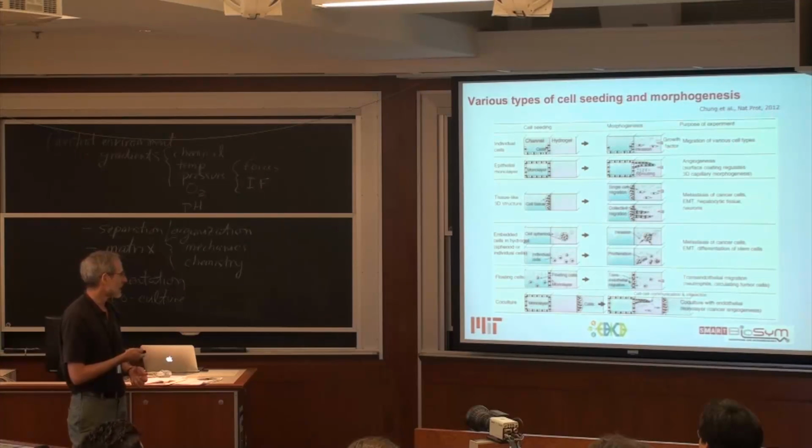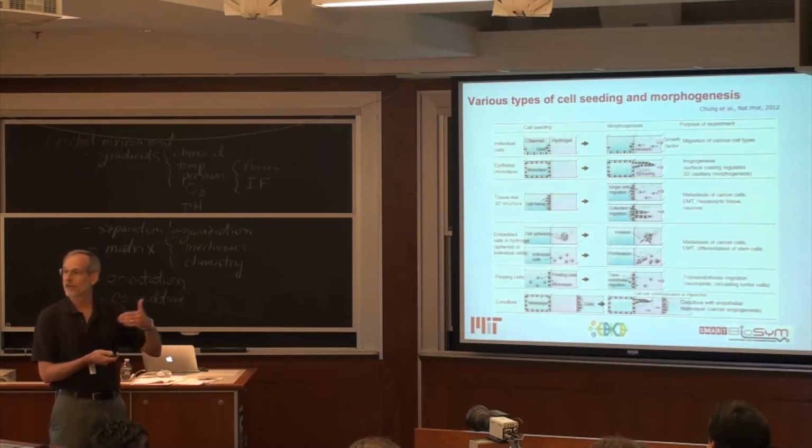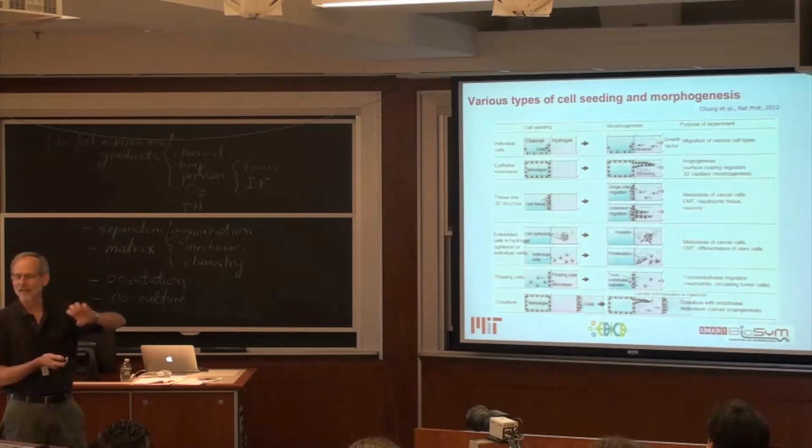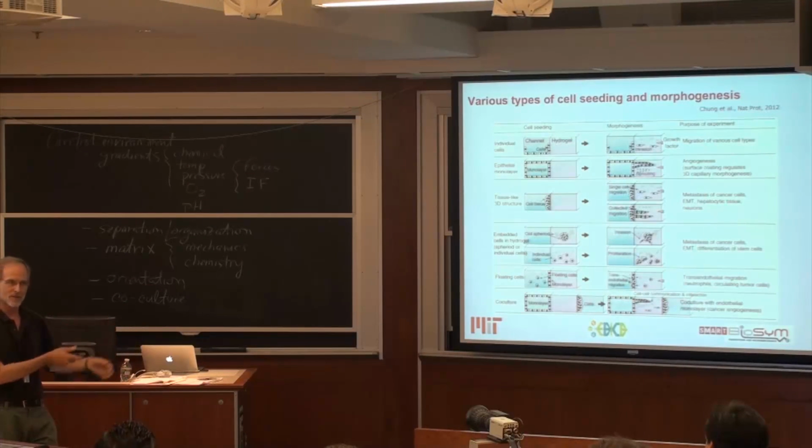the tissues. And you can do this then, as I say, looking at interactions with an endothelial cell layer, and in fact you can look at the intravasation process. The cell is not only migrating through the tissue, but also coming up to the endothelium and then transmigrating across the endothelium to get into what would be the vascular system in the patient.